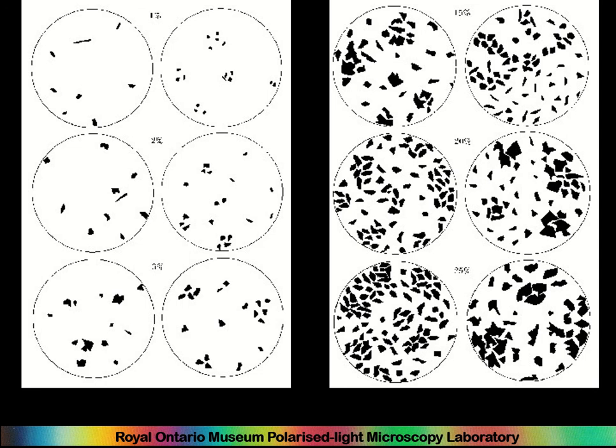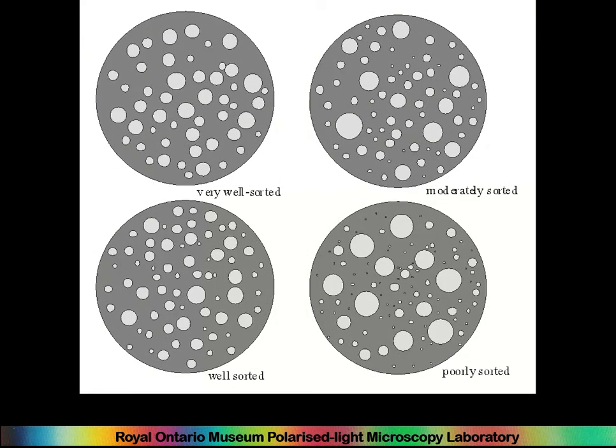And so I would do all this point counting, and I would bring the results back to my boss, who was the head of department, and he would check my findings to make sure they were actually right by looking at comparison charts. So it was good to do all that counting and have all that apparently precise scientific data, but he made sure it was right by looking at comparison charts. So it's very rapid, very easy, and it's actually scientific, so do it.